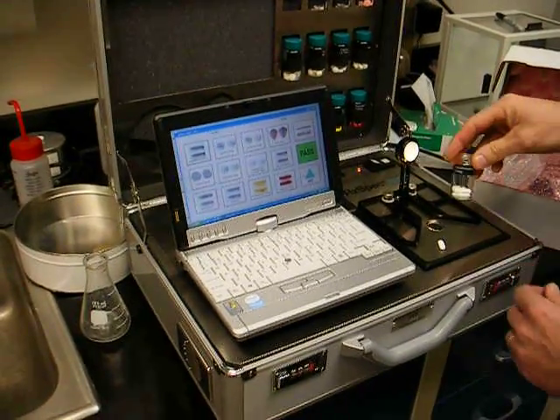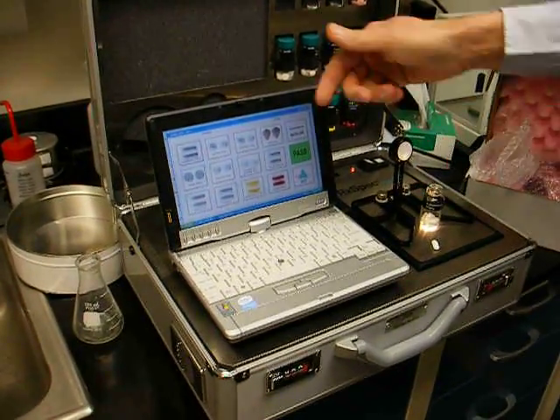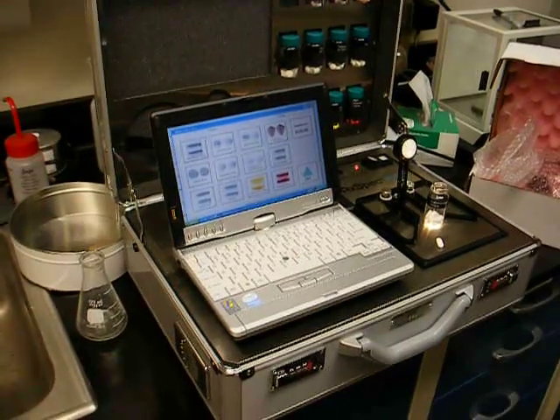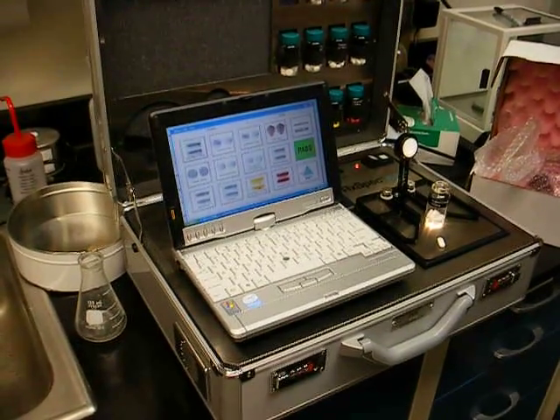Samples can also be analyzed in a bottle. And again, we get a result.